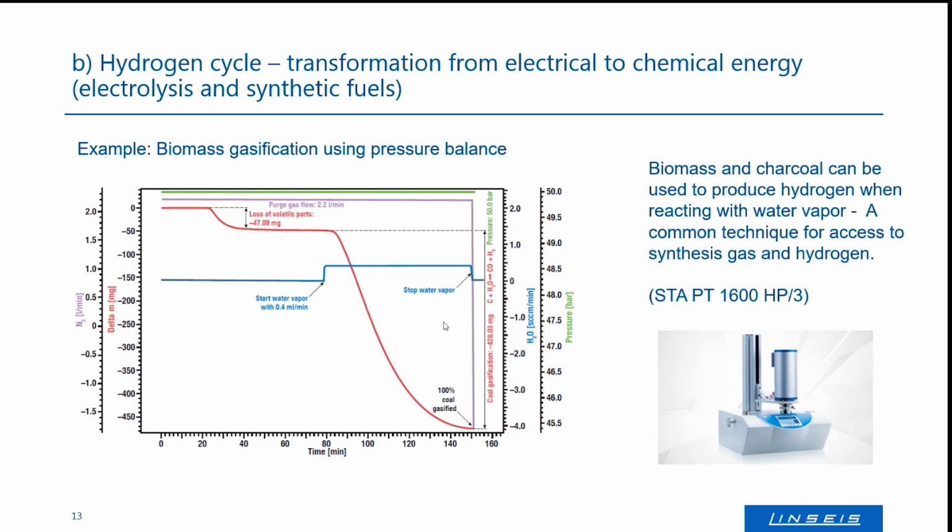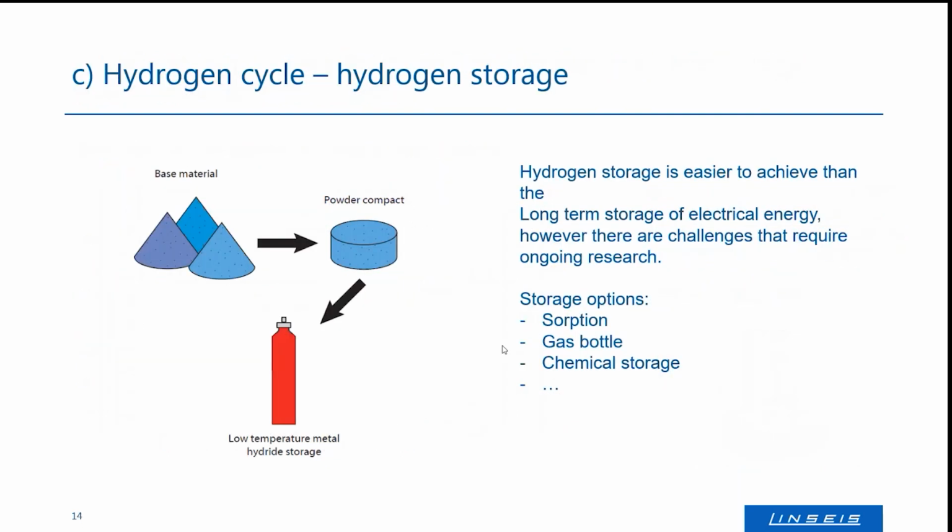Of course, in our thermal analyzer, we just analyze the process. We analyze process speed, transformation rates, and ideal pressure and temperature, and so on. In technical scale, of course, you would try to separate the gas and not optimize the conditions, because for optimizing conditions, that's why thermal analysis is used here. But this is one of the typical applications that we recently did.